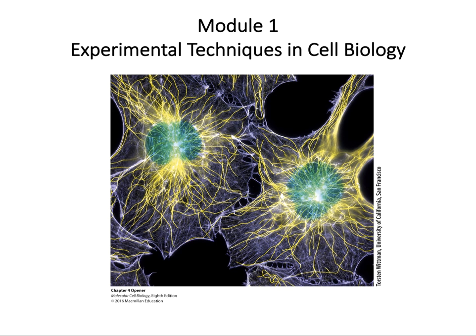In Module 1, we are going to learn about the experimental techniques in cell biology. I have confined the topics to mainly cover some of the routine methods used by scientists to study the cells. The topics will include growing cells in the laboratory outside a living animal, visualization of the cell and its structural components, and isolation of subcellular components. By subcellular components, we mean the components that make up a typical cell.